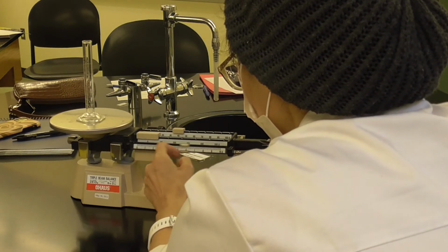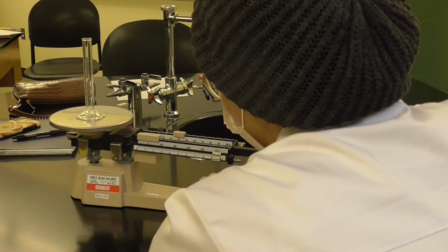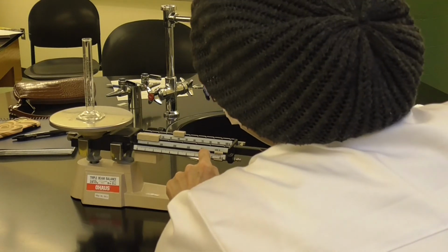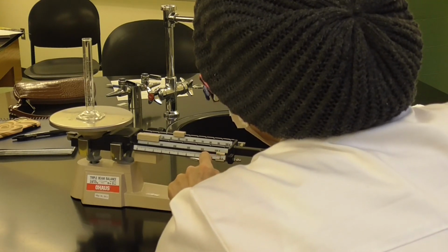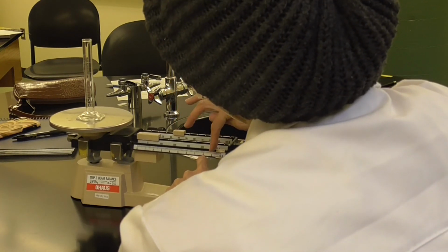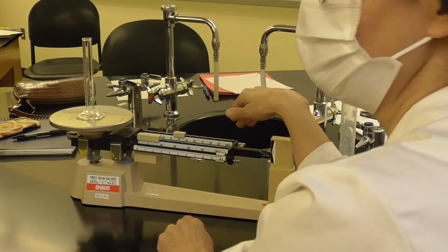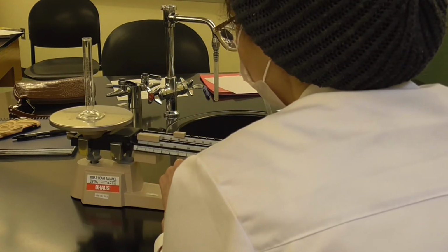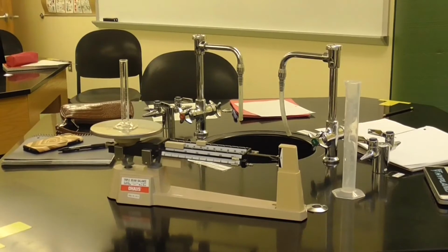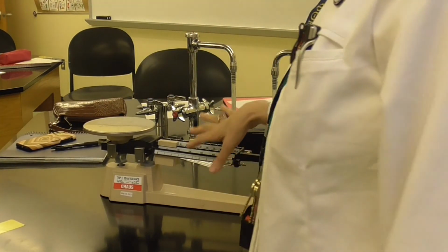So you see, it went down. I'll go back, and come back here, and I'll bring this here. Okay, so now it's coming. So it's almost 49.9. 49.9, okay? So this is 40, this is 10, but it is a 9.9. So that's how we measure it. So that's how we are going to use the 3-beam.